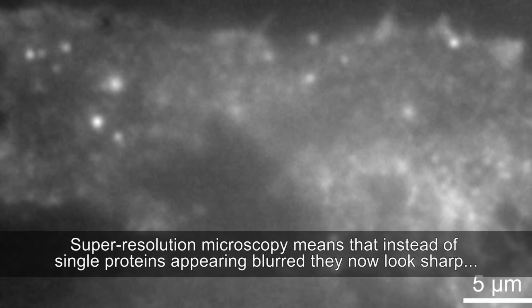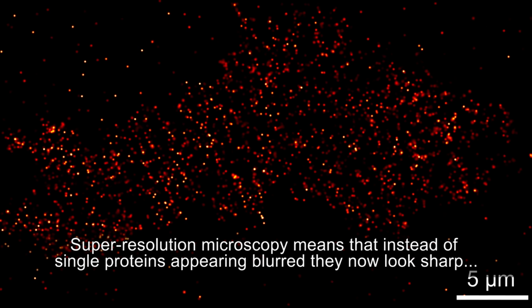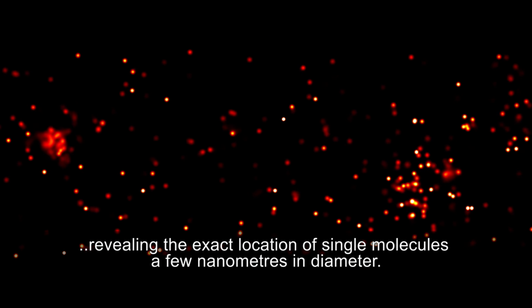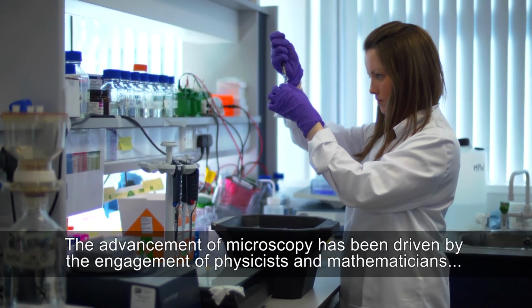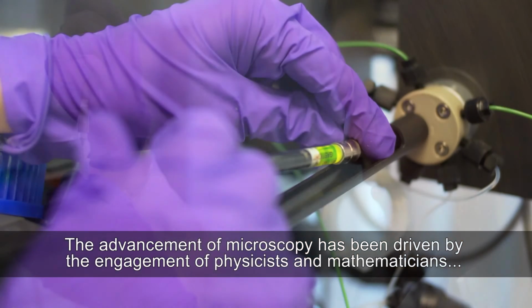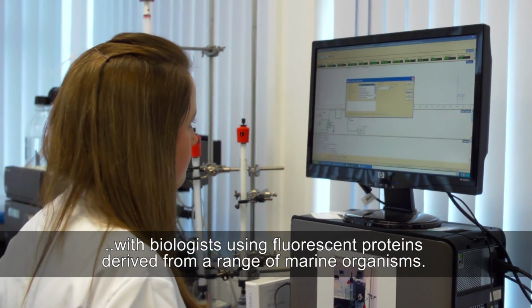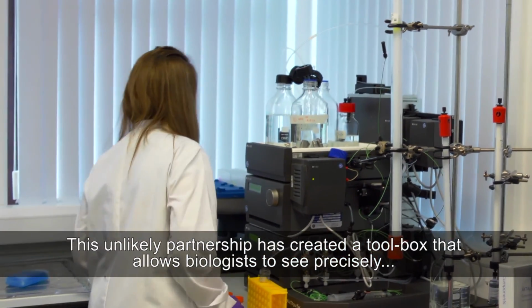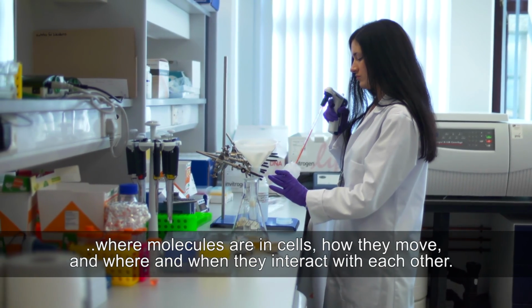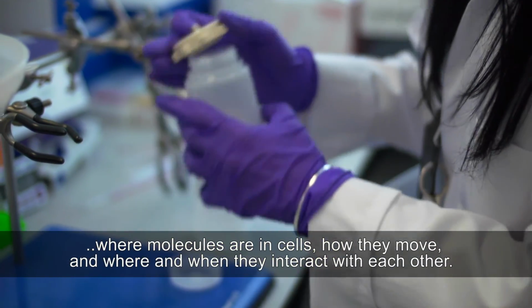Super-resolution microscopy means that instead of single proteins appearing blurred, they now look sharp, revealing the exact location of single molecules a few nanometers in diameter. The advancement of microscopy has been driven by the engagement of physicists and mathematicians with biologists using fluorescent proteins derived from a range of marine organisms. This unlikely partnership has created a toolbox that allows biologists to see precisely where molecules are in cells, how they move, and where and when they interact with each other.